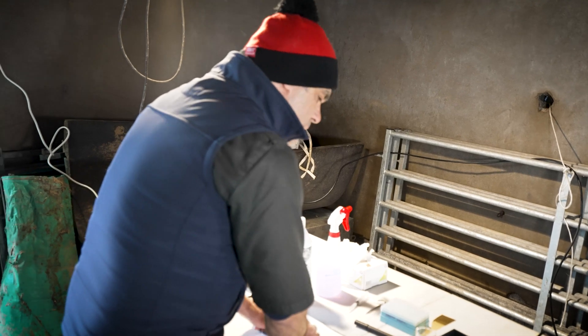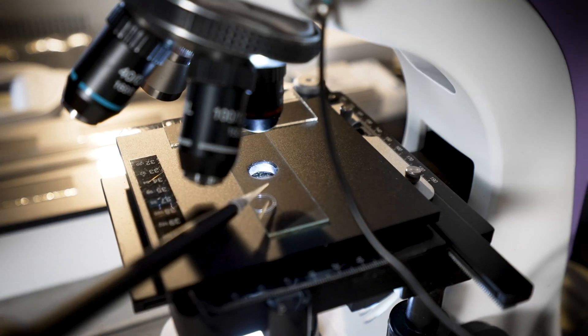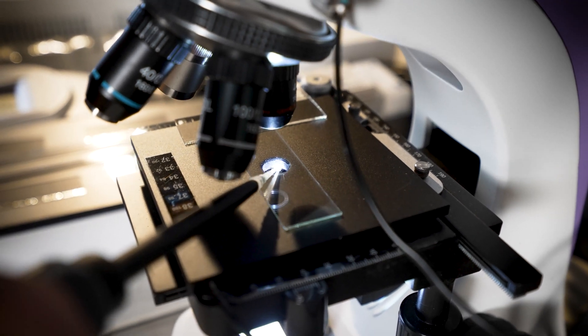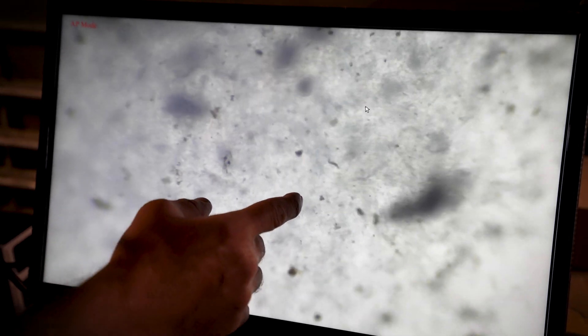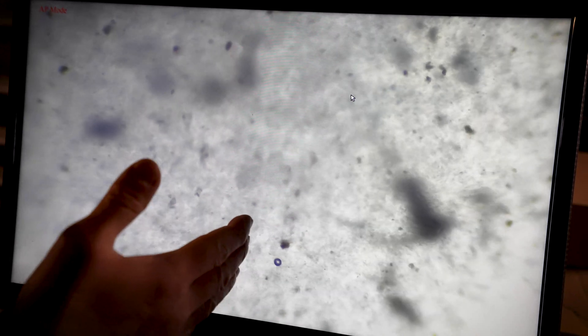Now we're going to examine the sample under the microscope. Very gently, we place the sample. There's a fairly good wave. What we're looking at is the way it moves. I would give it, out of five, I would give it 2.8 — at best a three. I would be happy to use this for natural service. He's a young ram; maybe later on he will improve even further. The better the wave, the better the success rate.